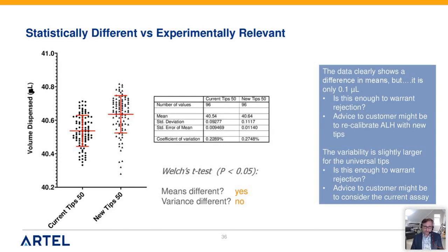So it's not enough just to do a statistical analysis. You want to run this first and then run your assay and compare your uncertainty values there. So again, you'd want to run this because this is a very quick test, and then put it in the context of your assay.